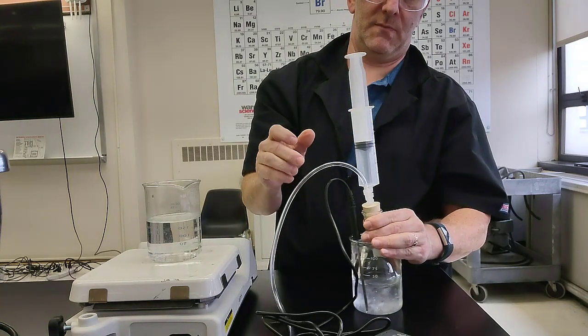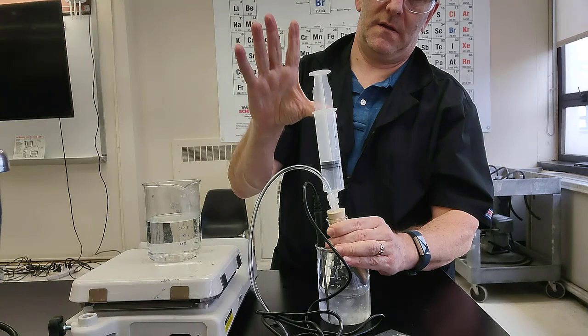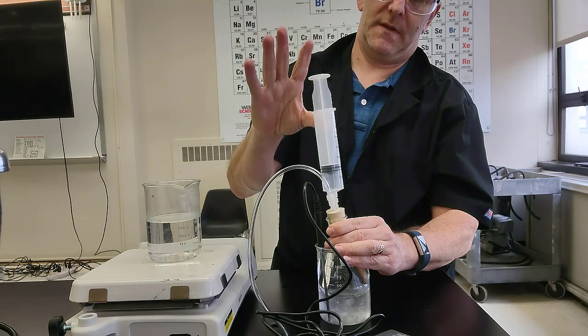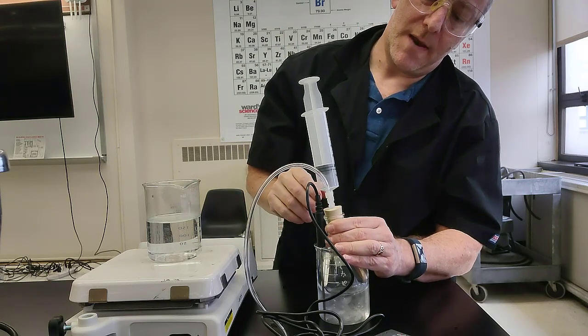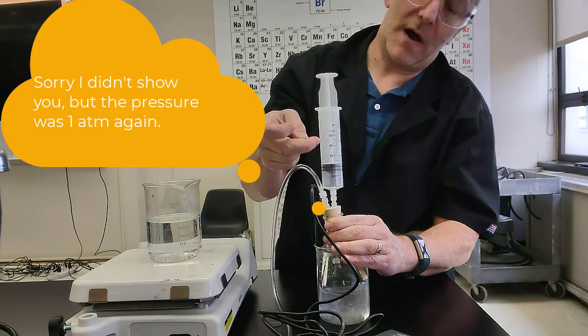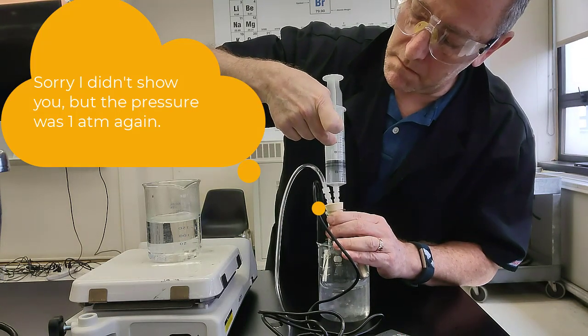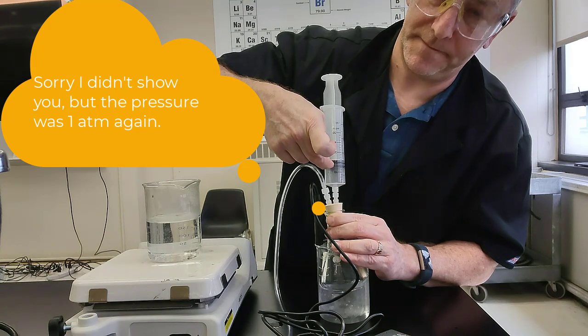Let's see, the syringe isn't moving as freely as I would like, but let's see what happens if I touch it. See, if I squeeze it too far, it bounces back. But our volume now is 15. It went from 30 down to 15.